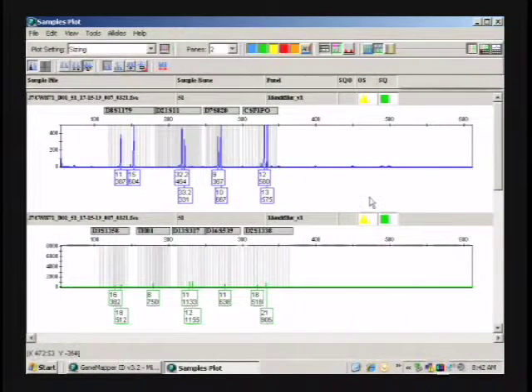What I wanted to show, I remember there were some people who only had me add 1 microliter. And I know that was A1, B1, C1, starting from, I believe, D1, because I injected those first. So you'll see with the 1 microliter, there's a big difference. Let's see, 500. You still did get an increase because it was about 200 before. So now it maybe doubled in some cases. So you did get an increase with just adding 1 microliter.